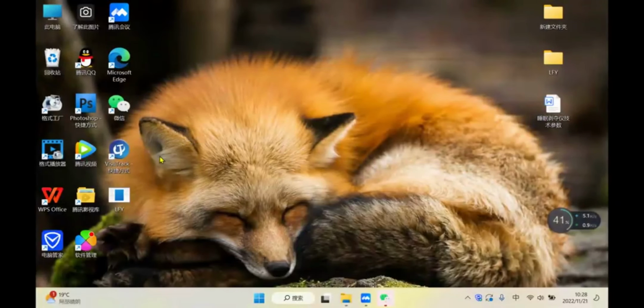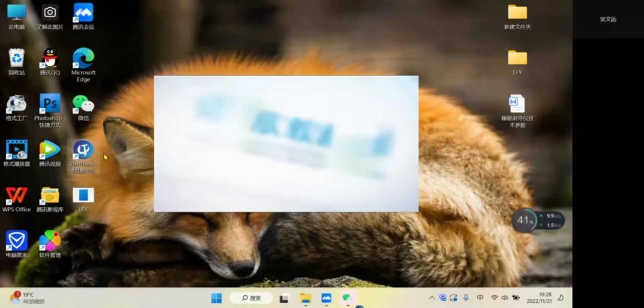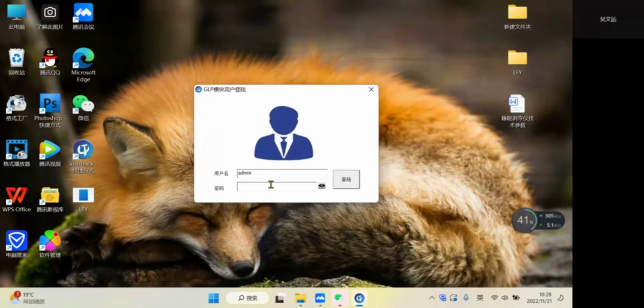Hello everyone. Today I will demonstrate the analysis process of the water maze experiment using our software VisuTrack. Enter the password.